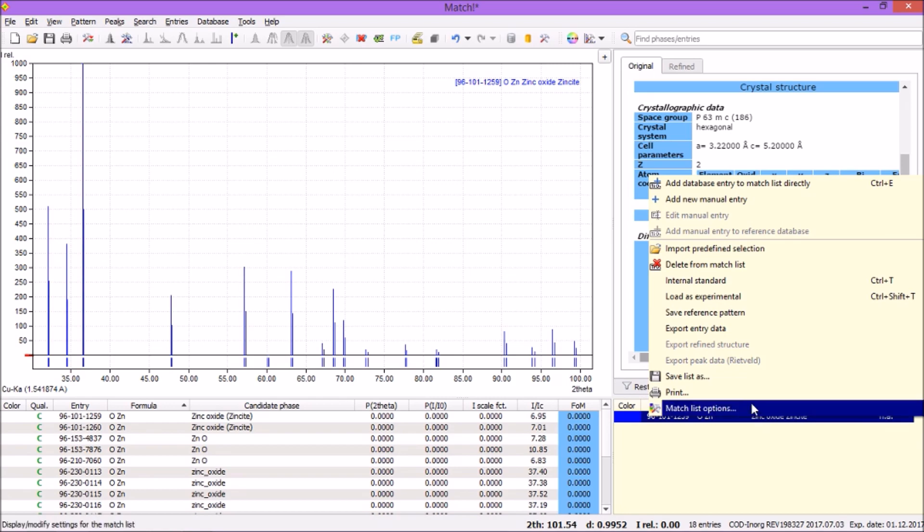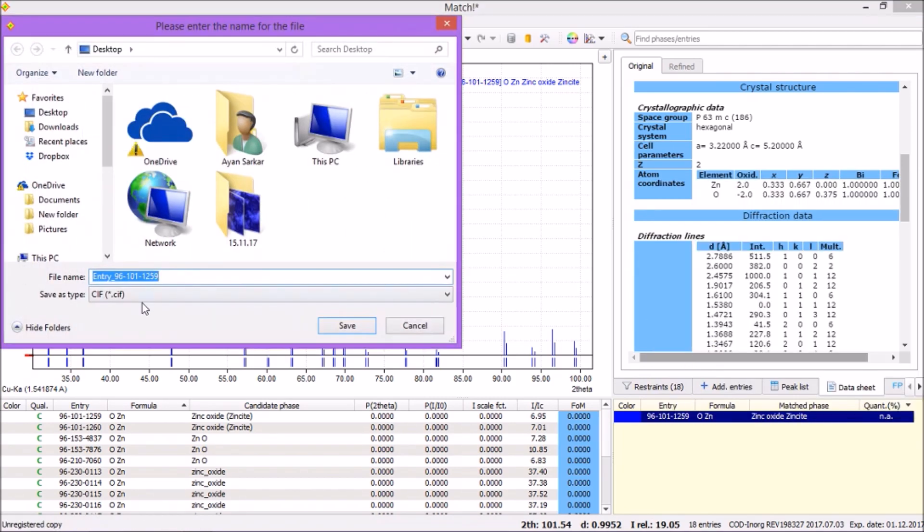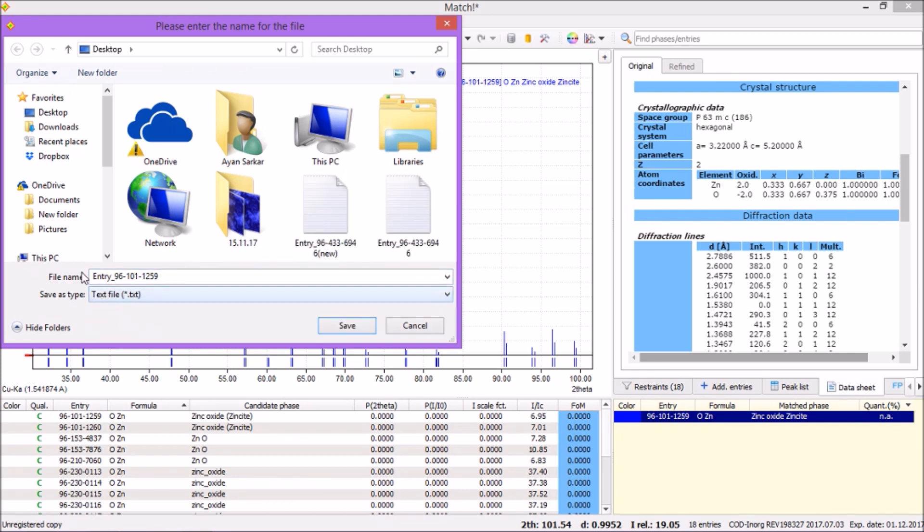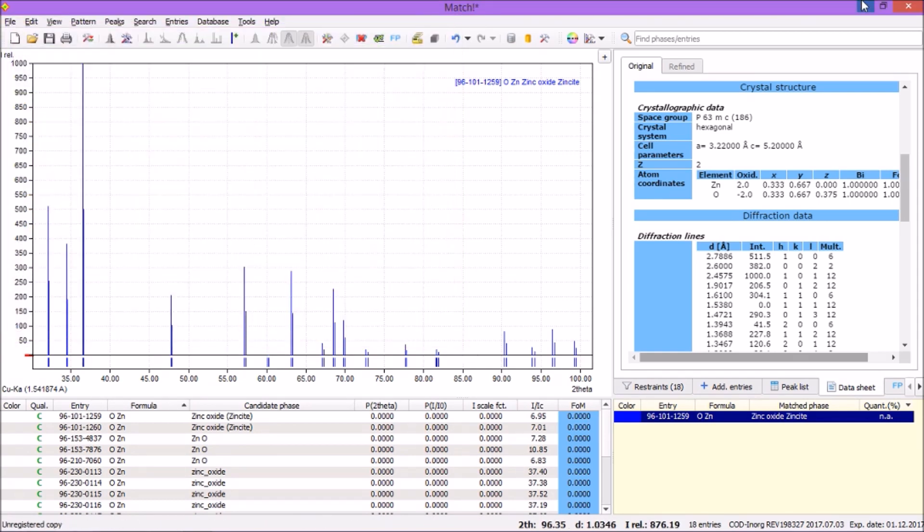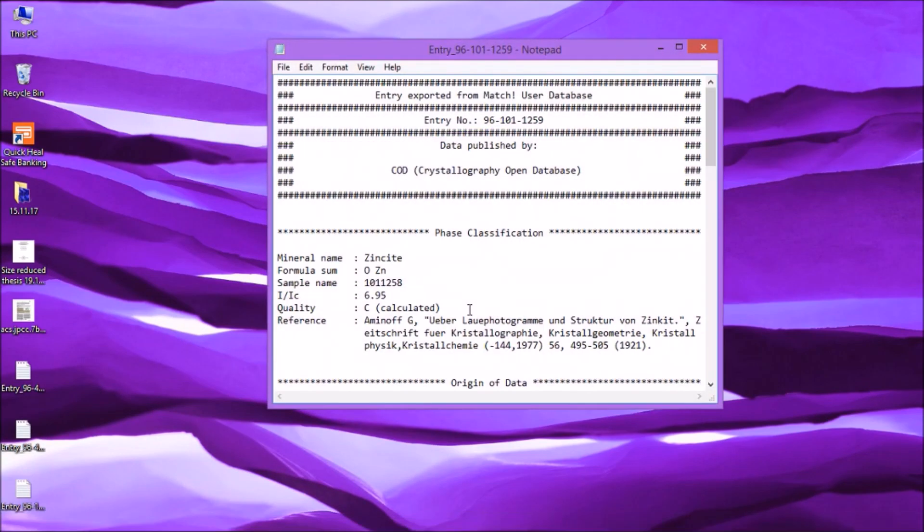And export entry data. Now you can change it to txt file. The text file is there. Here's the entry number. I'm saving it right on my desktop. Let's see what I have obtained.